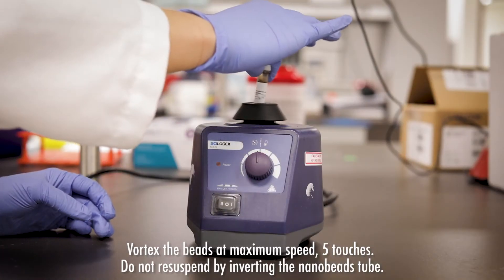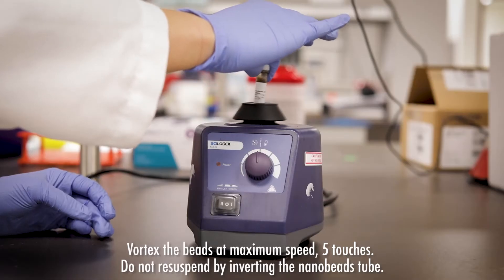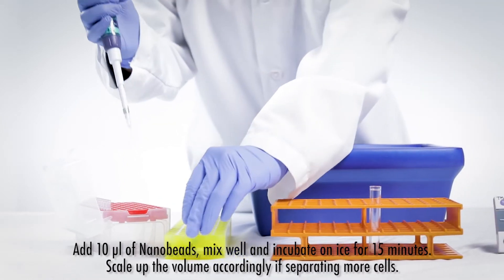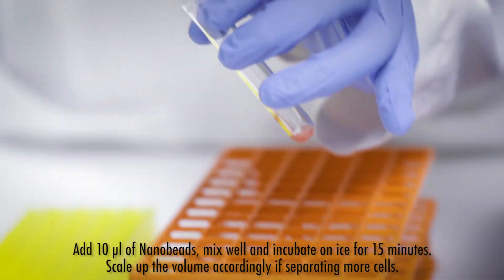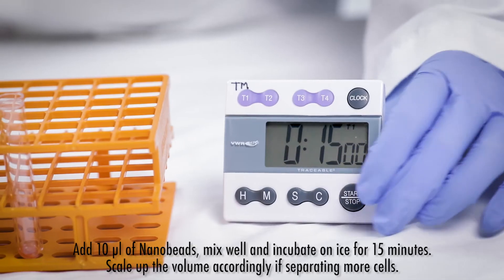Re-suspend the beads by touching them 5 times over a vortex set at maximum speed. Add 10 microliters of nanobeads. Mix well and incubate on ice for 15 minutes.